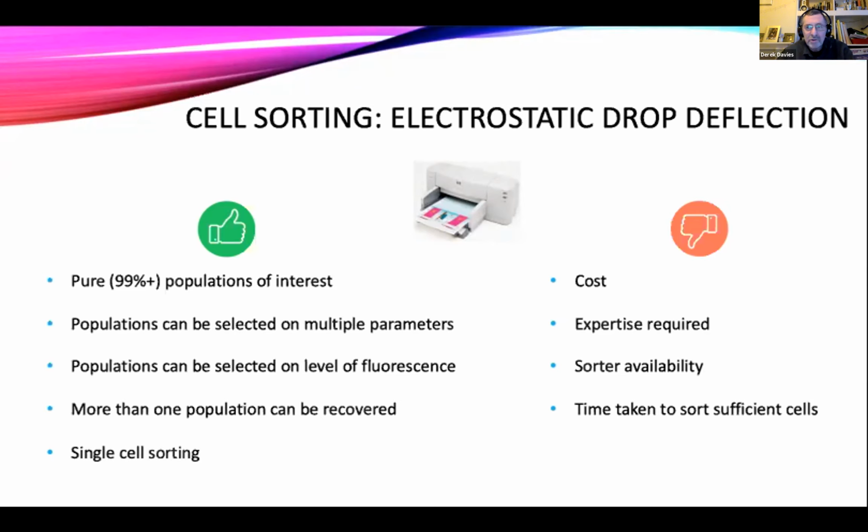They'll do a transfection and they'll want to retrieve their 10% GFP positive cells, or they'll want to separate the CD3, CD4 positive cells in blood. And the reasons why they might want to do that are varied, and sometimes we don't necessarily need to know too much about that, although it is very useful to know what the end product is going to be of our cell sort. But we can sort cells to a high degree of purity. 98, 99% purity should be fairly routine, and that of course is what people initially want.